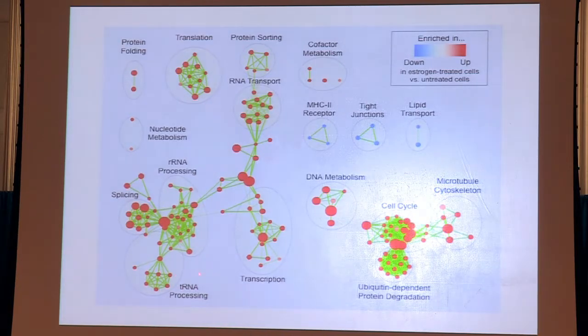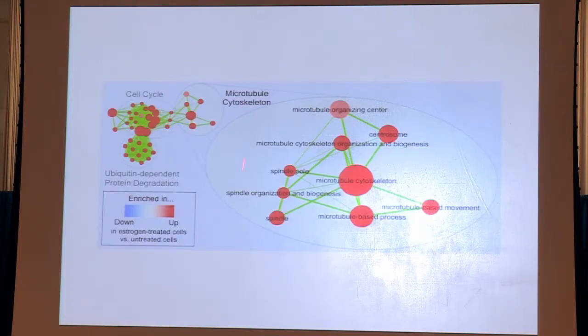Maybe some of these pathways are already well known to you based on your expertise in studying the system that you're looking at, and so those might not be as interesting. And others you might not have seen before, and so maybe you want to zoom in on those. So you can, as I mentioned, zoom in and see the individual pathway names, and you can zoom in further, which I'll tell you about later.